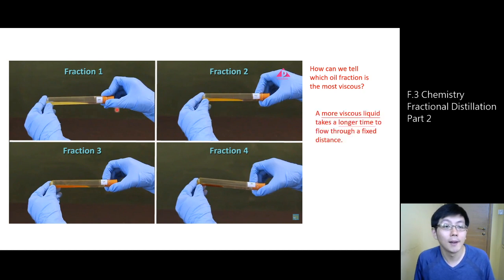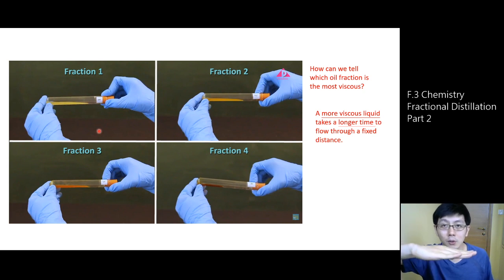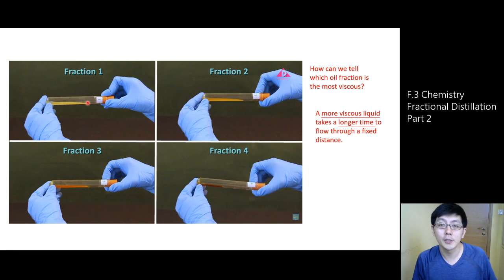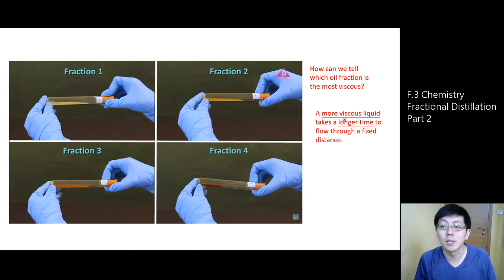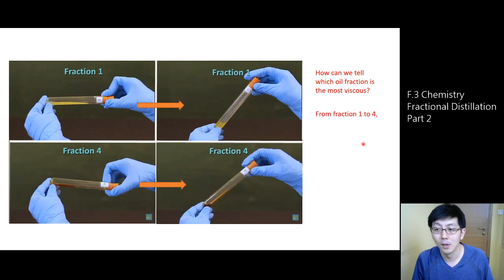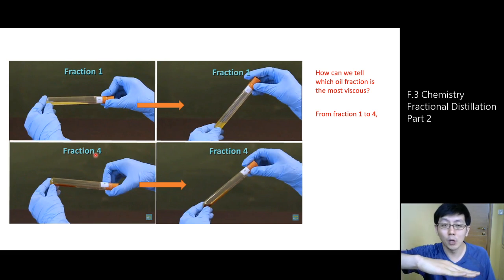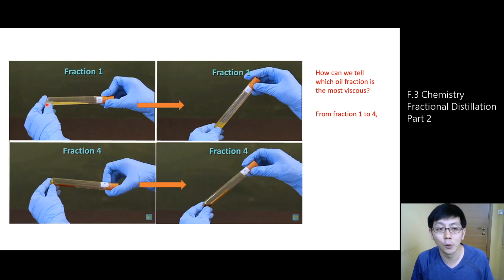We compare the time for the liquid to flow a fixed distance. When the test tube is placed horizontally, the liquid flows from one end to the other. You may use a stopwatch or just observe the time for the liquid to flow a fixed distance — say from the bottom of the test tube to the mouth. If the liquid is more viscous, it will obviously take a longer time to flow through a fixed distance. Here I extract two experimental results: fraction 1 and fraction 4.